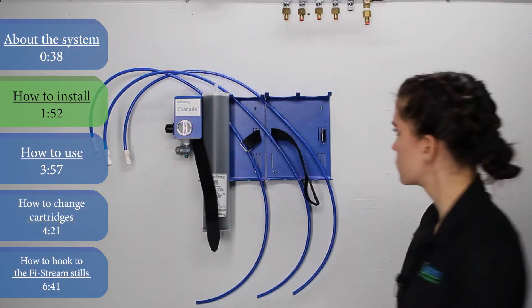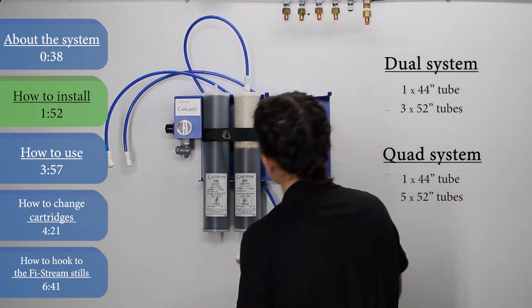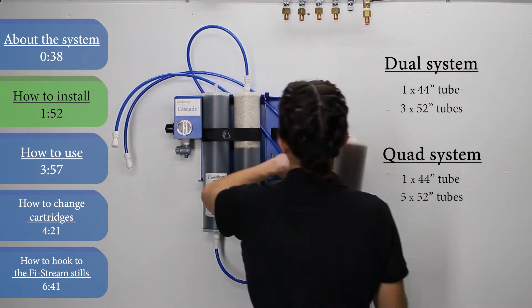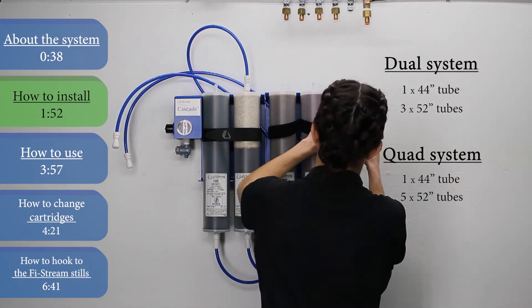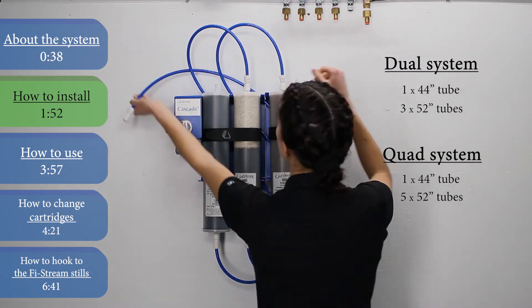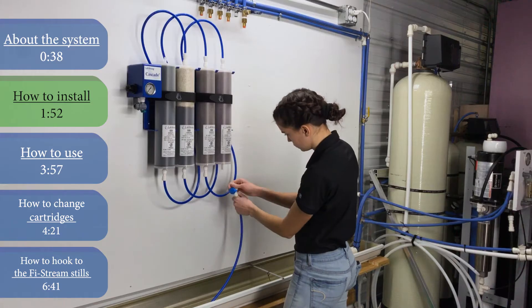Next, install your cartridges one at a time, connecting your fittings and tubing with each cartridge you install. If you have the dual system, your shipment will come with one 44-inch tube and three 52-inch tubes. If you have the quad system, your shipment will come with one 44-inch tube and five 52-inch tubes. Cartridge packs are not included with the Cascade system, but you can purchase them separately from our website or over the phone. To connect your fittings to the system, push past the first resistance you feel and listen for a click sound to know that the fittings are locked into place.